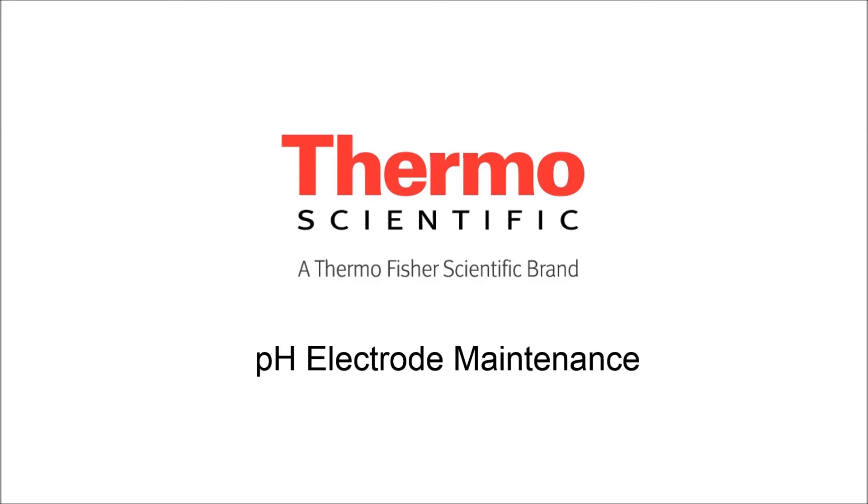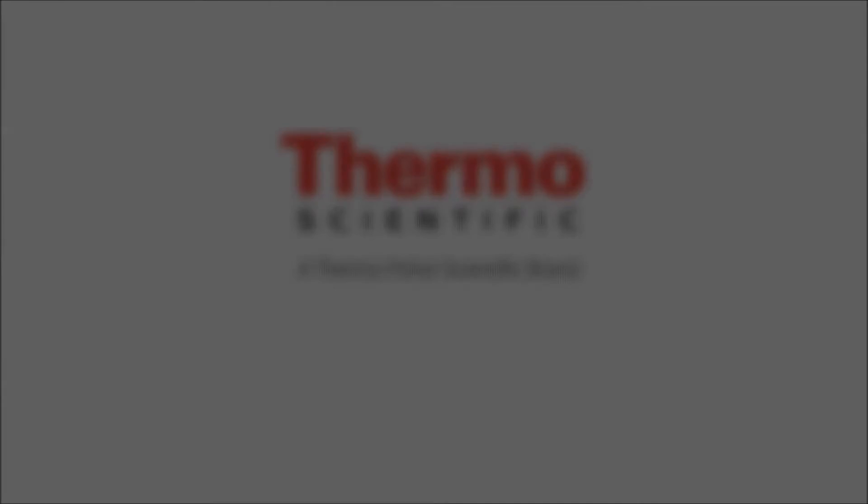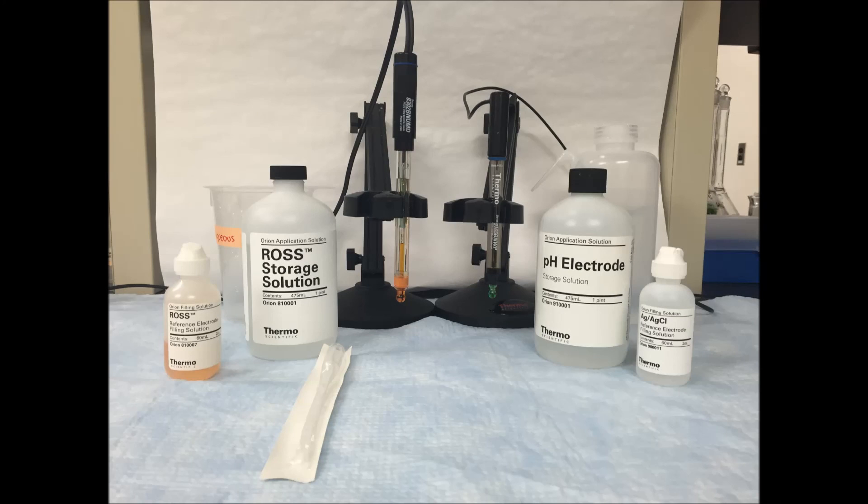Today we're going to discuss pH electrode maintenance. You want to maintain your electrode to keep them fast, accurate, and functioning well, as well as to keep them clean from contamination and make sure that they are working properly.